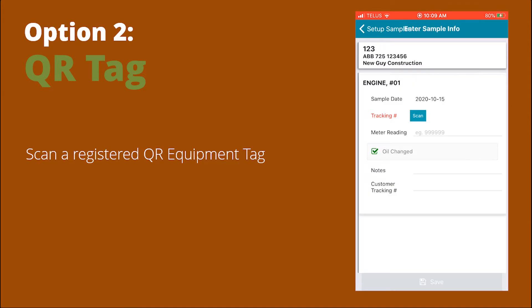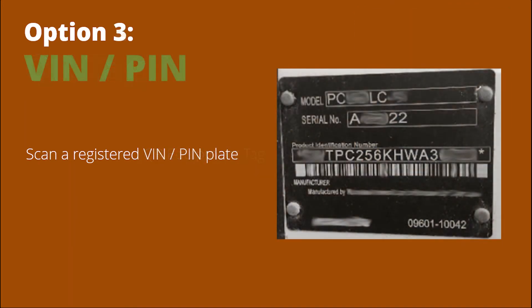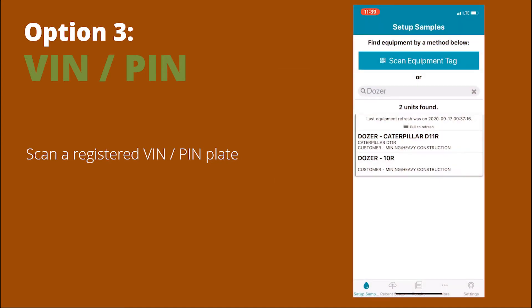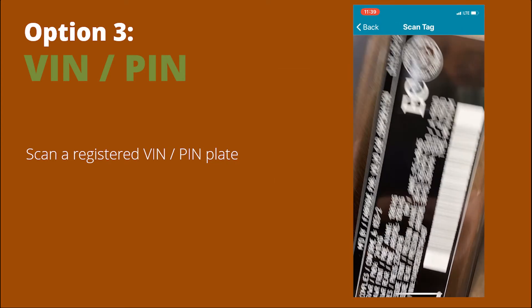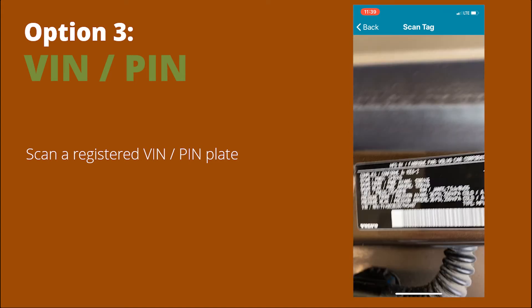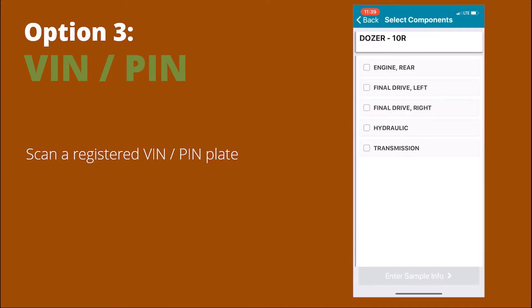Scan the tag and find your equipment. The third way is to scan using a registered VIN pinplate. Once again, go to Set Up Samples, then Scan Equipment Tag, and take a picture of the VIN or pinplate, and it'll take you directly to the equipment registered.